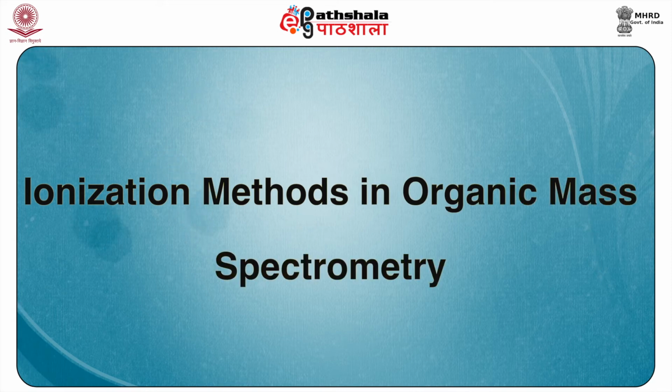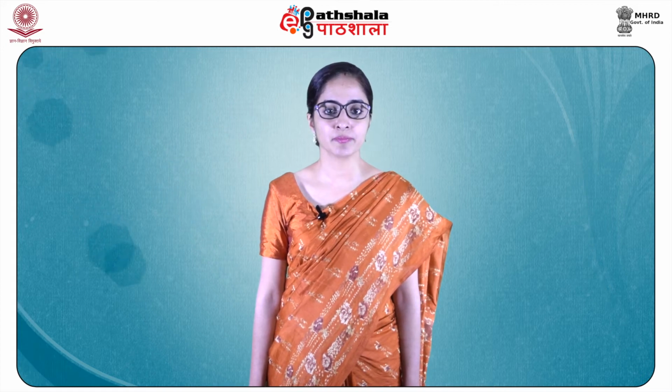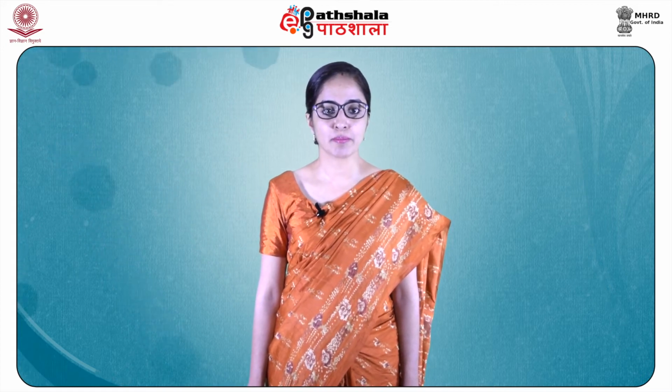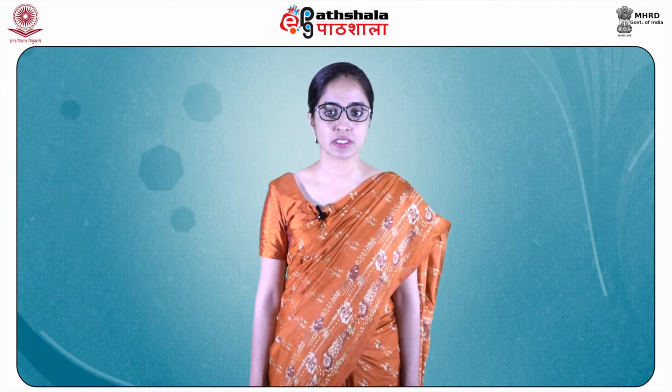Now let us discuss ionization methods in organic mass spectrometry. Irrespective of the method of sample introduction discussed earlier, once the stream of sample molecules has entered the mass spectrometer, they must be converted to charged particles by the ion source before they can be analyzed and detected.